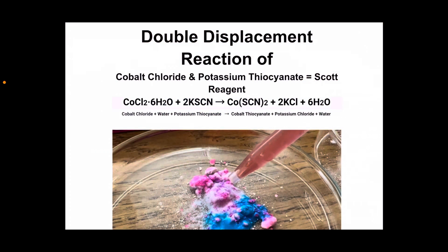So in this double displacement reaction, we started with cobalt chloride in an aqueous solution — that's the CoCl₂ — and then we added that to potassium thiocyanate, that's the 2KSCN. Those are our reactants. When they combine, the metal ions trade places, and you get the products cobalt thiocyanate, that's the Co(SCN)₂, and potassium chloride, the 2KCl, and water. And this is called Scott Reagent, and it's used to detect the presence of cocaine.